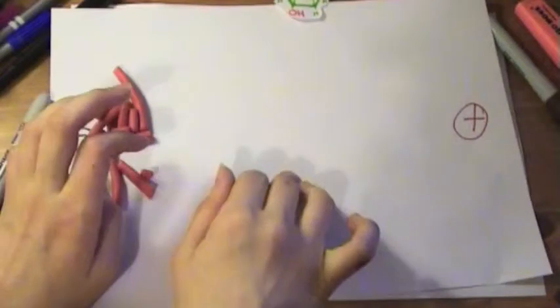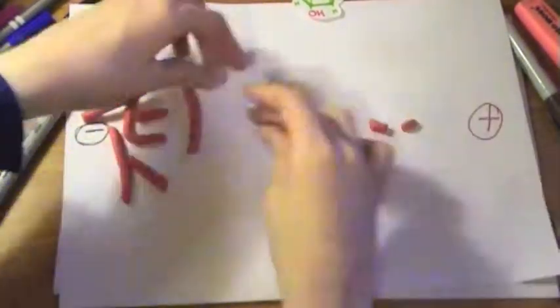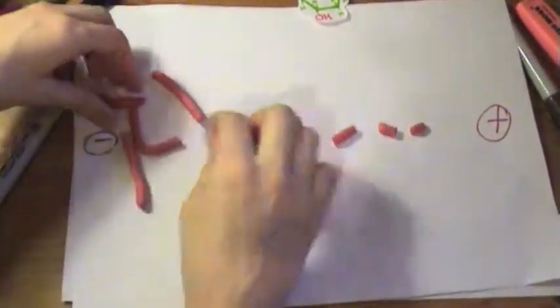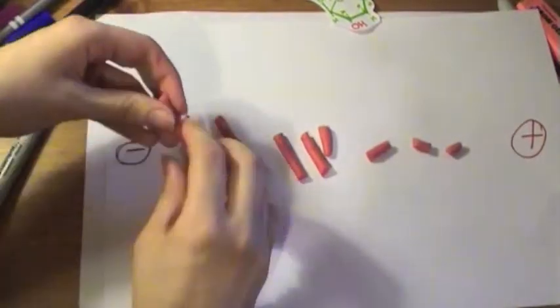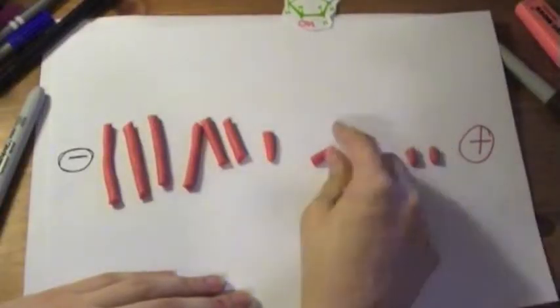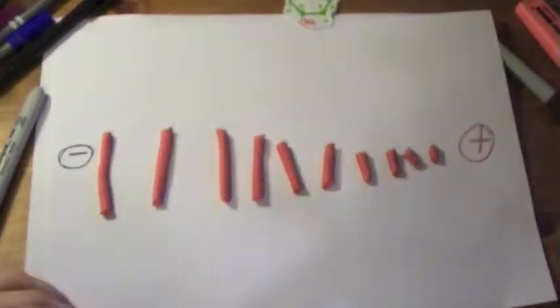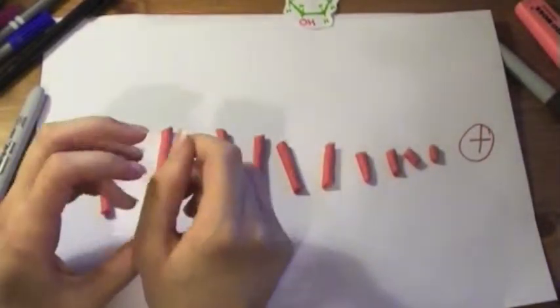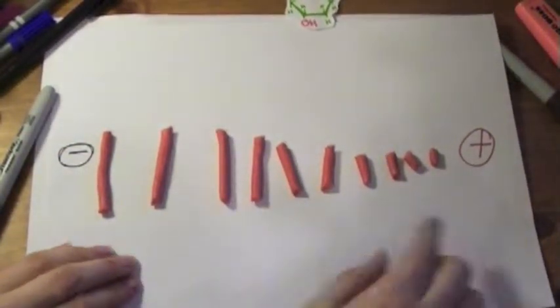They all start obviously in the same place. And then you start your timer and gradually they'll all move. So after a certain amount of time, they'll end up in bands by size. And obviously they won't look like that because inside your tiny sample of DNA that you put in, you're going to have thousands and thousands of each of these fragments. So they all sort of come up looking like a little square block. But they are separated by size because the smallest ones can move through quickest.